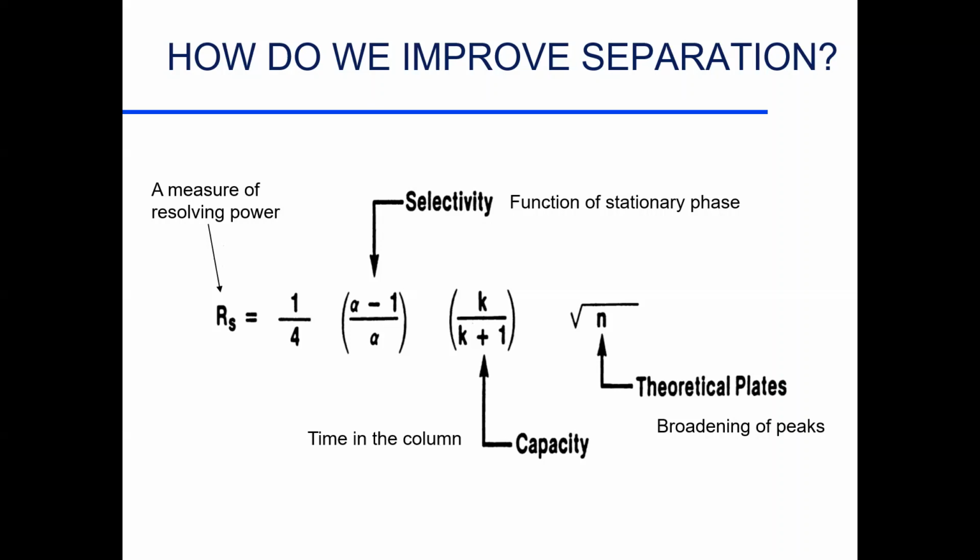And that gets into this term. This is one that's kind of trivial, I guess, in a sense. And that's how close to the solvent does it elute? Is it coming out real quickly? There's very little interaction. Here comes your solvent. You get this big peak, and then there's maybe a peak of interest. But you don't have much time for interaction. You don't have much time for separation. It spends very little time in the column before it elutes.